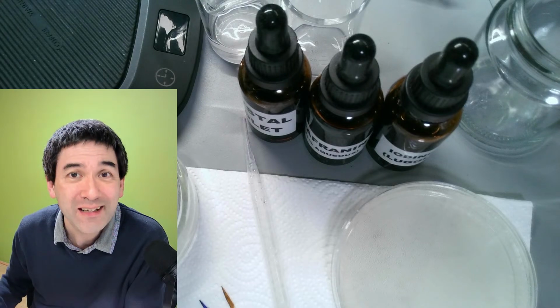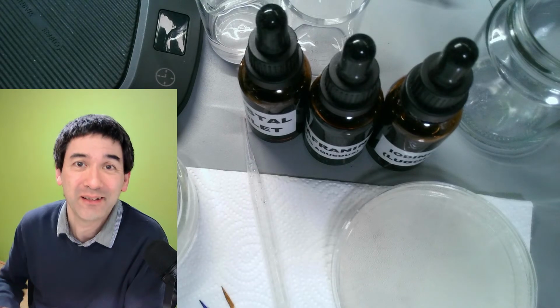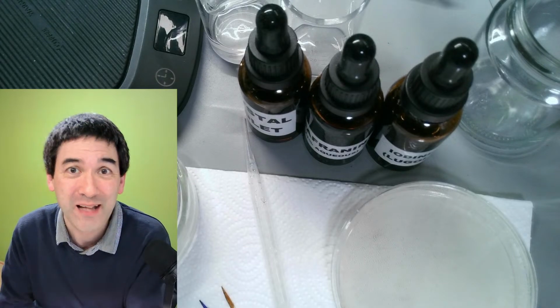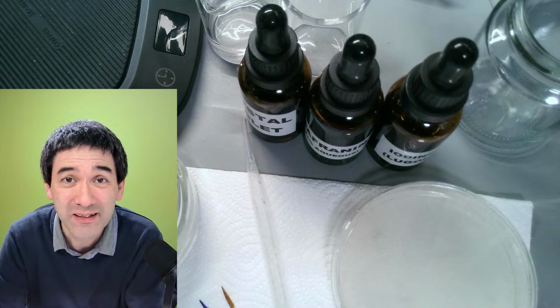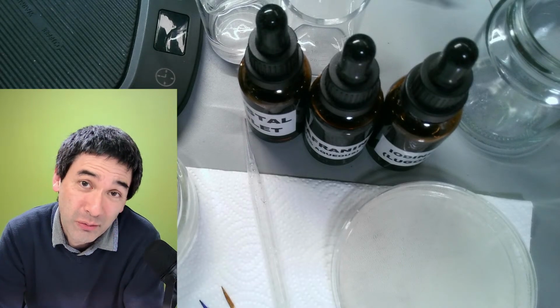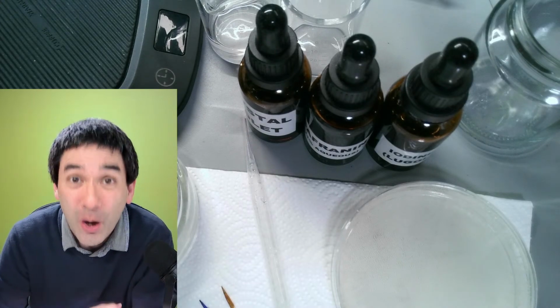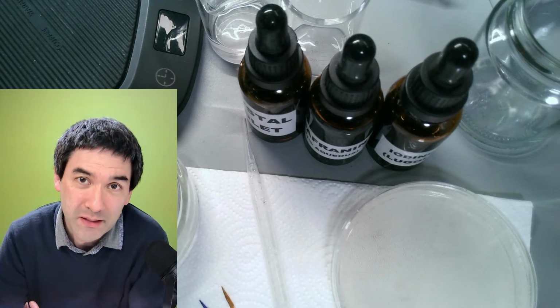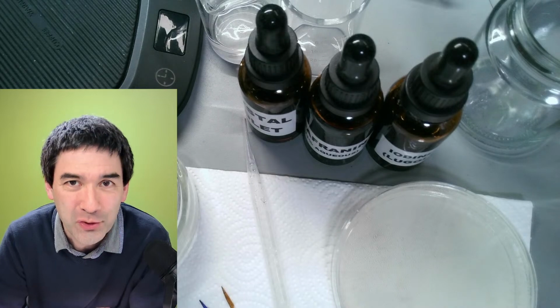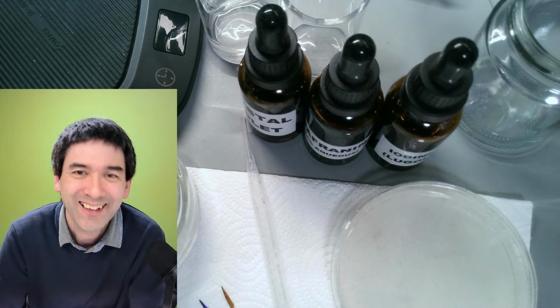And I'm not saying that this is something that every hobby microscopist actually has to do. It's not necessary, but I think it's still interesting, or I don't know if it's important, but in any case, I hope it's interesting to know how it works. So basically, I'm doing the Gram stain for you so that you don't have to do it, to put it that way.